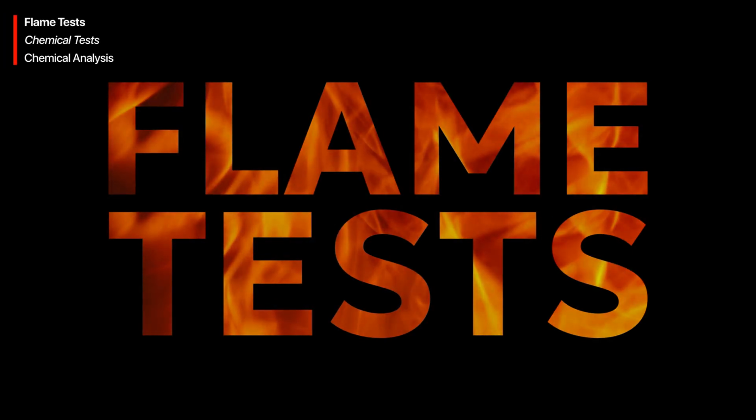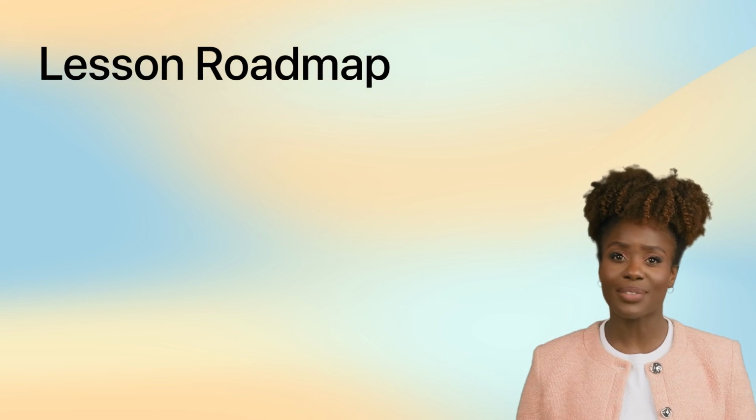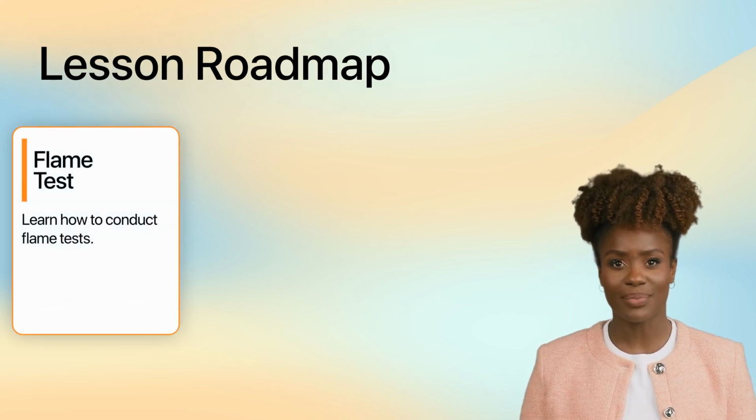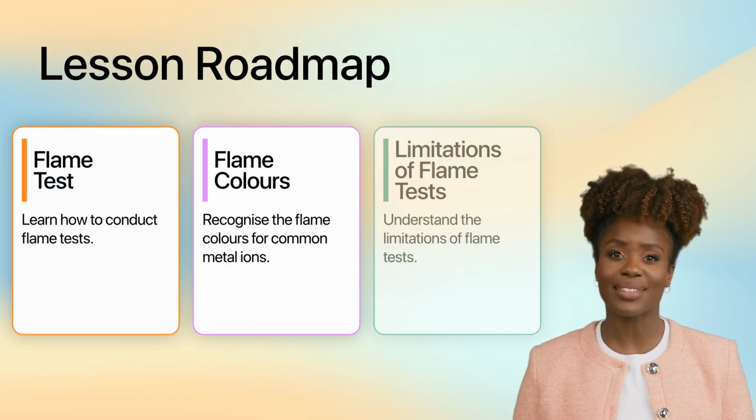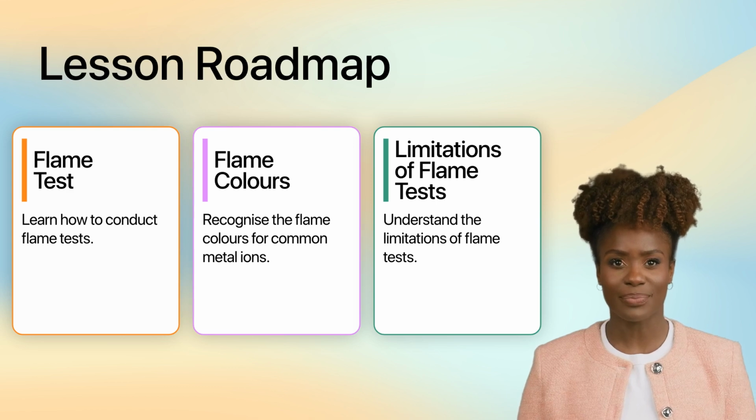Hello and welcome to this lesson on flame tests for identifying metal ions. In today's lesson, we will learn how to conduct flame tests, recognize the characteristic flame colors for common metal ions, and understand the limitations of flame tests.